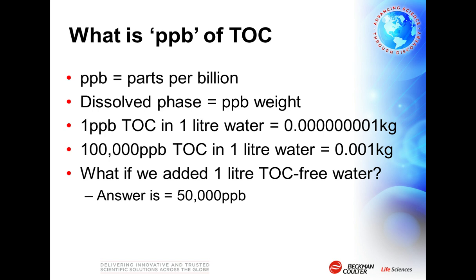Now, it's important to realize that the TOC, we report it in parts per billion. And actually what that's equivalent to is 1 microgram per liter of water. And of course, a liter of water is 1 kilogram if it's really ultra pure water. So we're reporting 1 microgram in 1 kilogram.